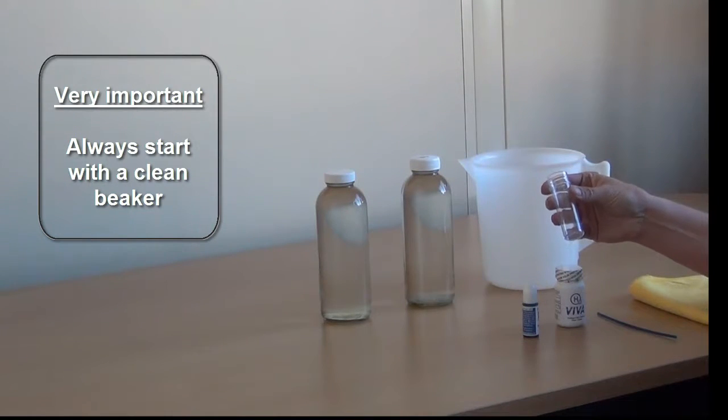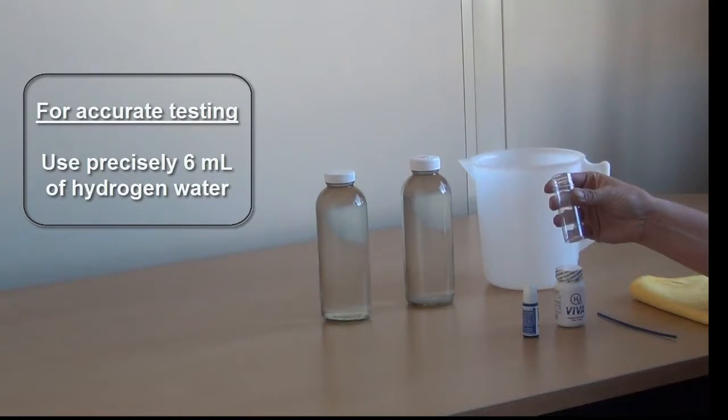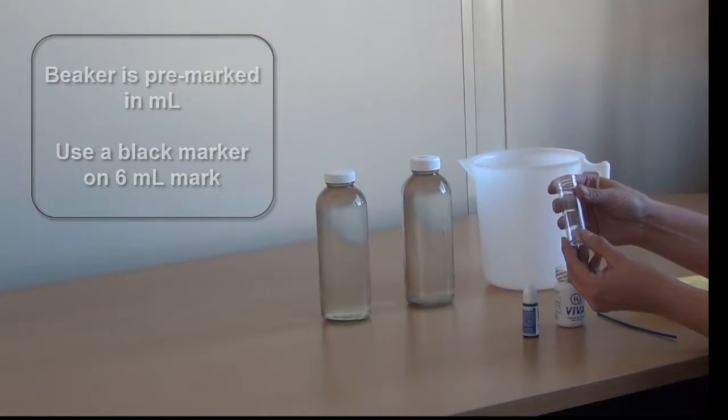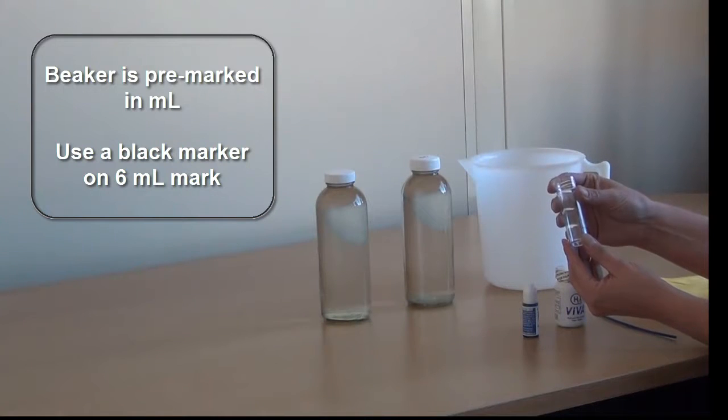You will need to use precisely six milliliters of hydrogen water for testing. We recommend making a mark on the beaker at the six milliliter level with a pen or a marker so that you can more easily see the level at six milliliters.